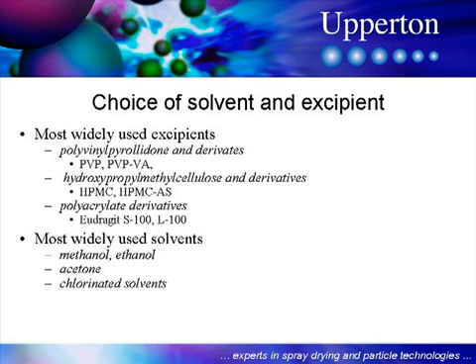Also, here are some examples of different solvents that we can use to create a spray dried dispersion. Obviously solvents like methanol and ethanol are widely used, as are acetone, and also some chlorinated solvents, although the pharmaceutical industry tends to look at these unfavourably.